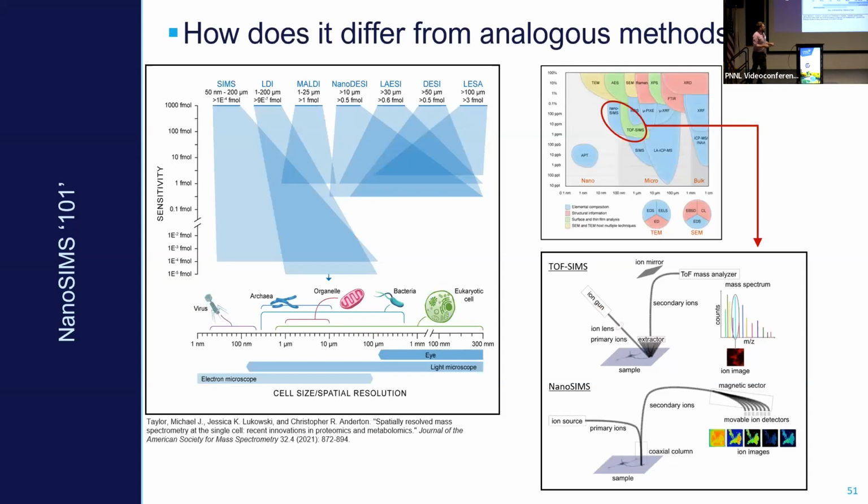So what I find kind of overwhelming for users in this whole field is just how many options they have for doing this type of work, even within a sort of niche field like imaging mass spec. There's just so many different things. This great image here shows you all the different modalities you could possibly choose. And even over here, you can start to see the choices we have with the sensitivity and resolution potential there. But it's kind of not the whole story.